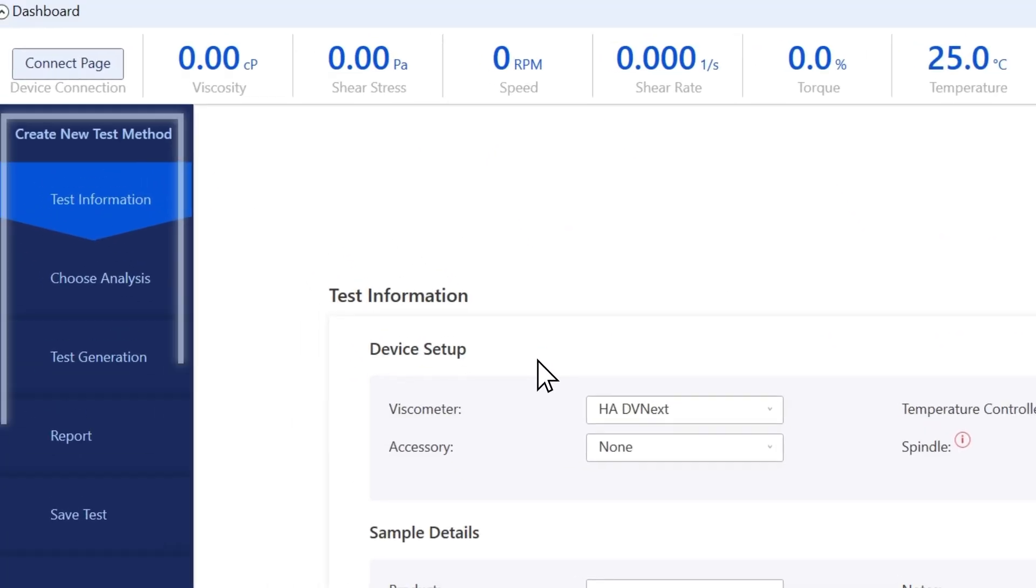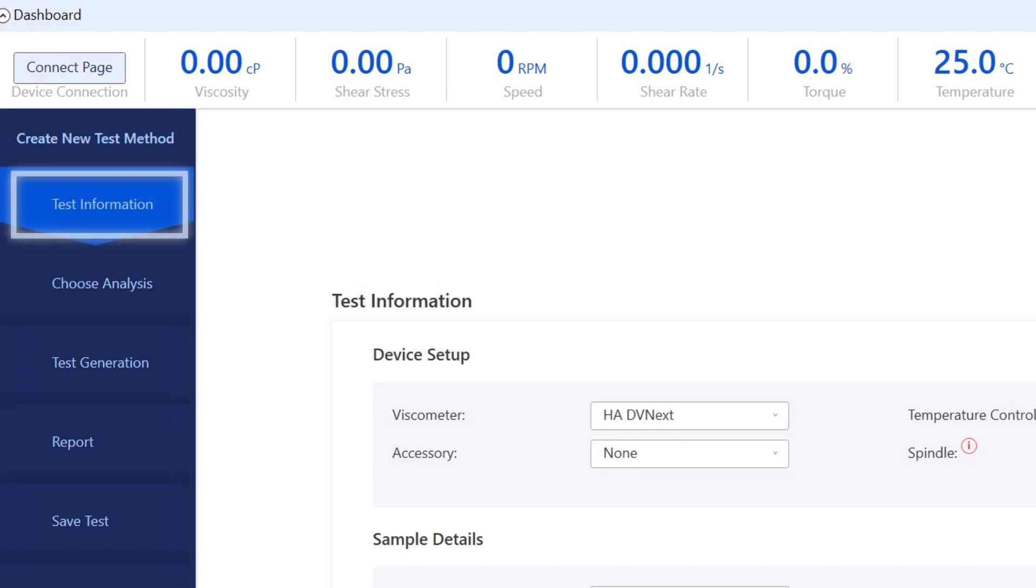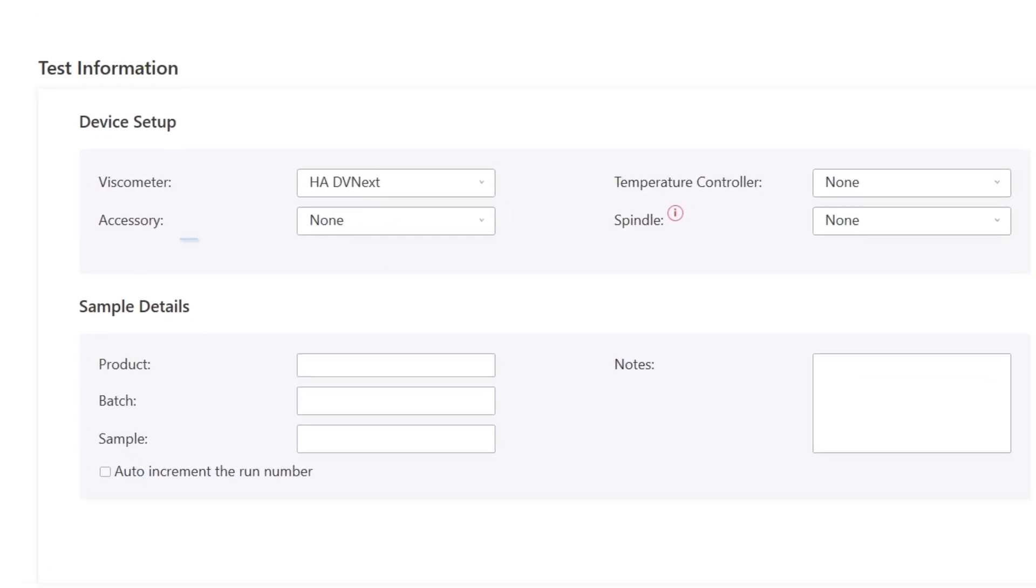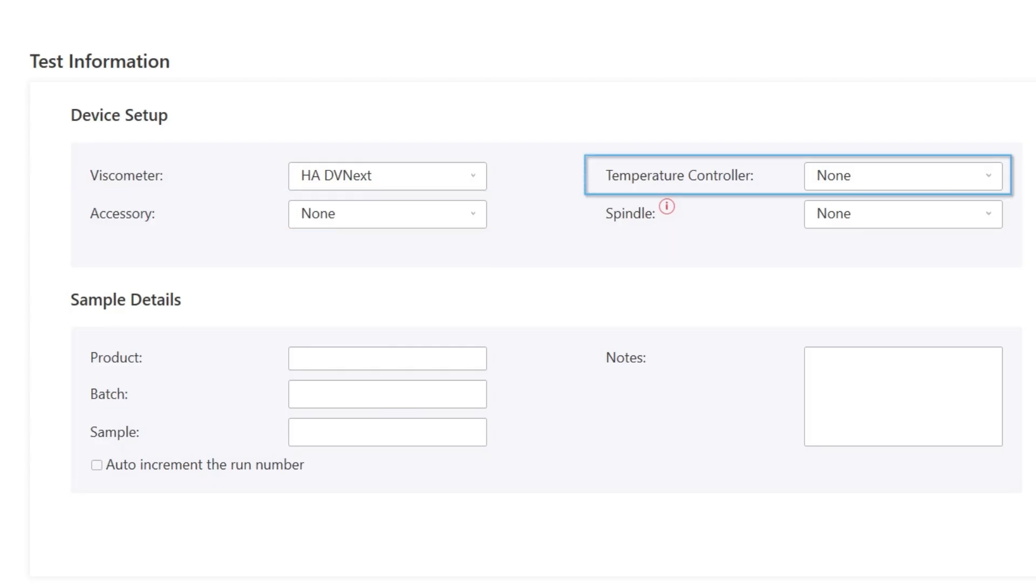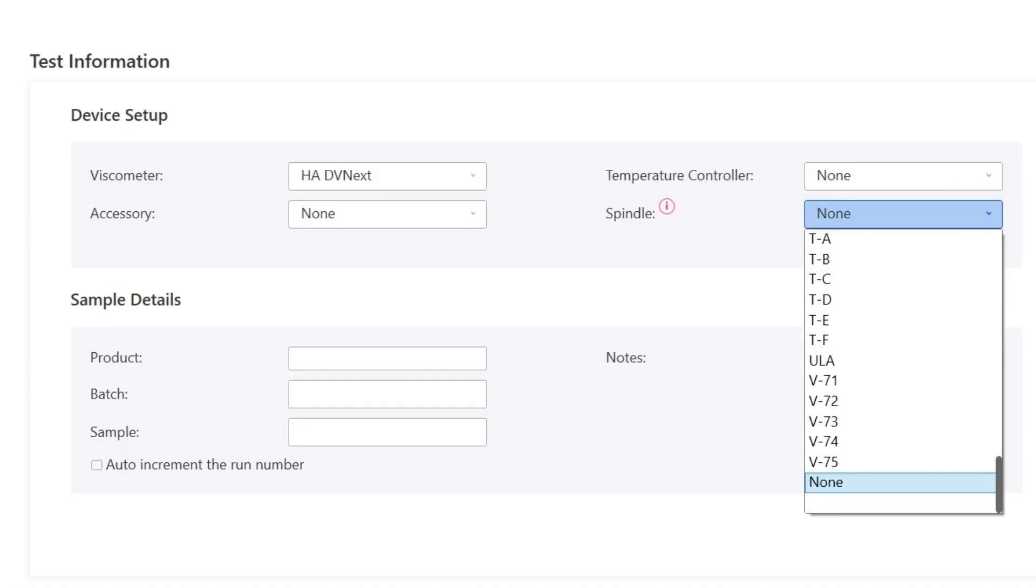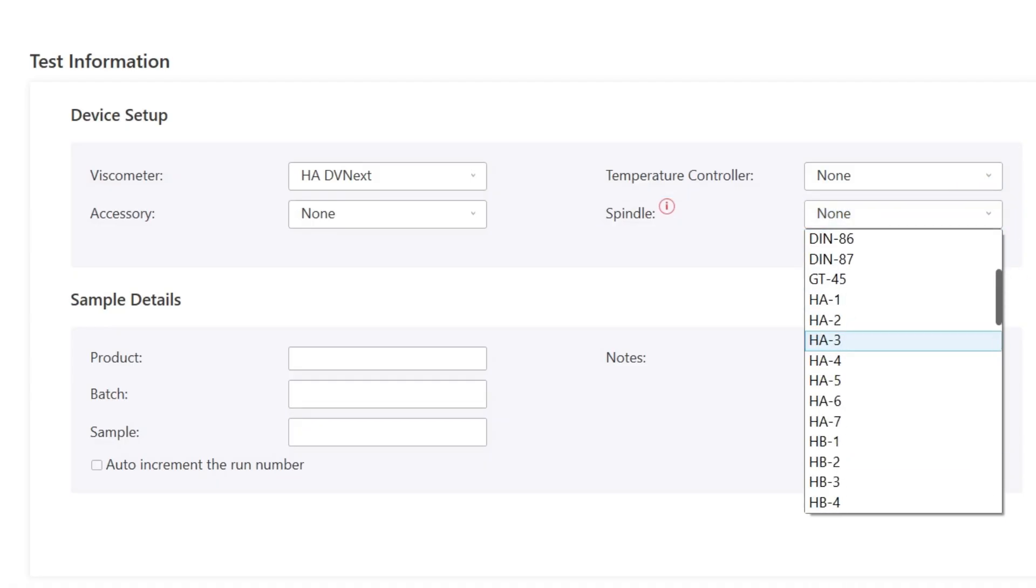Here's the test method. The first step is the test information. The Viscometer is already selected. For this test, we're not using an accessory and there is no temperature controller. We'll run at ambient room temperature. We're using the number 2 spindle. Select HA2 from the spindle list.